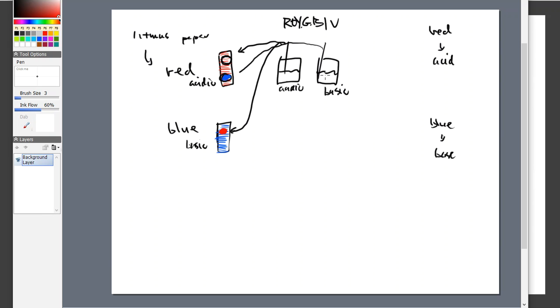Well, I do the same thing with my base. If I put the base onto my blue litmus, there goes my drop. But folks, my base is supposed to be blue, and that's blue paper. So I'm probably not going to see a color change.